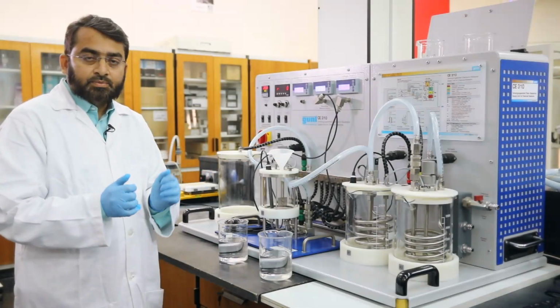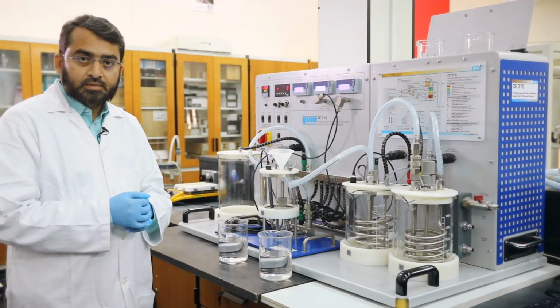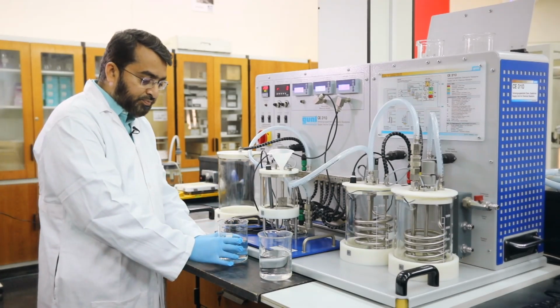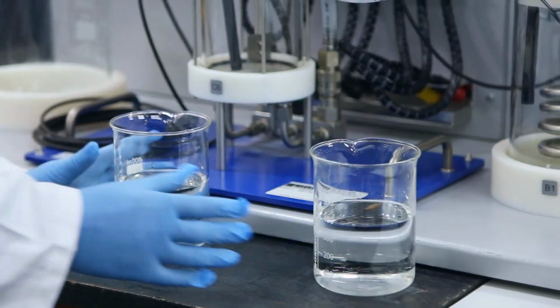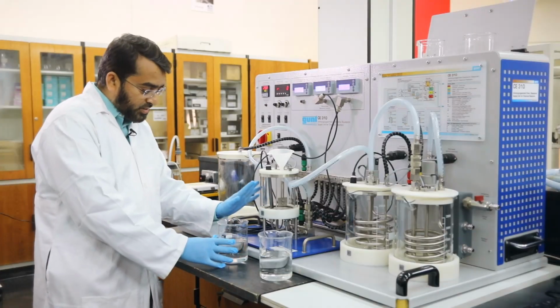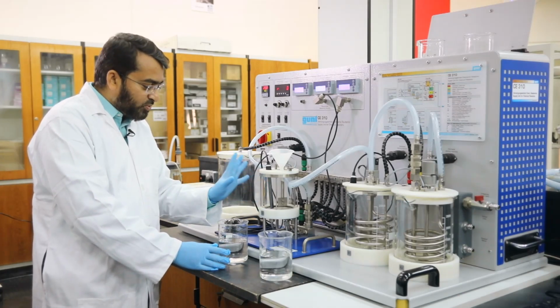We are going to conduct the batch reactor experiment as I explained to you. We have a reaction between sodium hydroxide and ethyl acetate, and I am going to mix these in the reactor. This is your batch reactor. The capacity of this batch reactor is less than 1 liter.